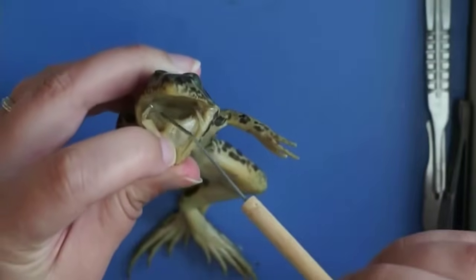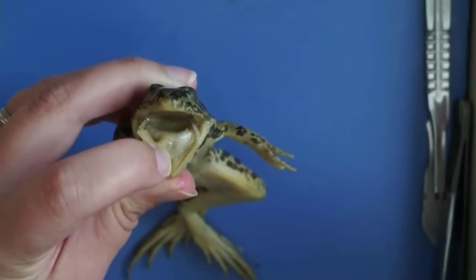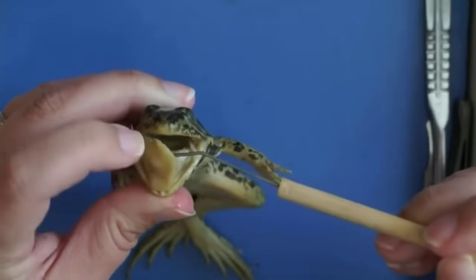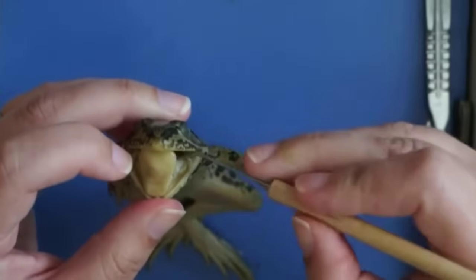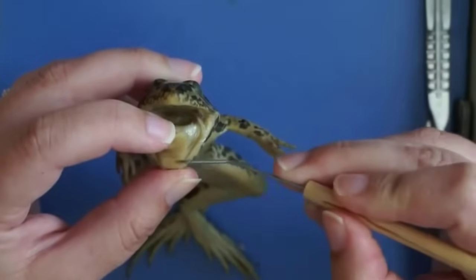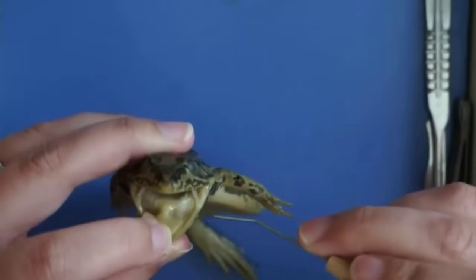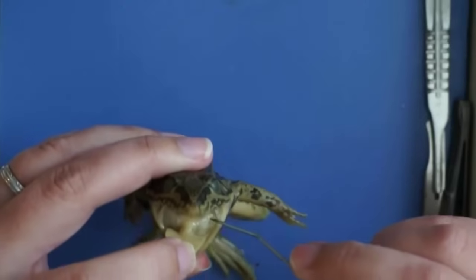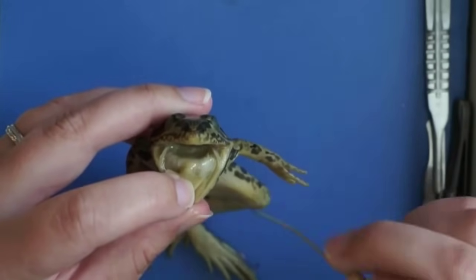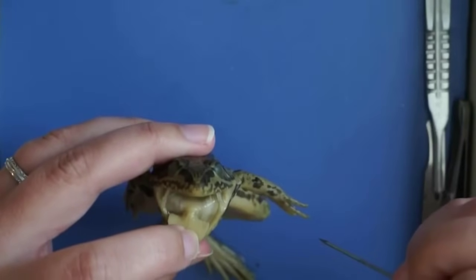You can also see two holes at the back of the mouth — those are openings to the eustachian tubes. The tongue can extend out very far, and it attaches in the front of the mouth in order to flip out much more quickly than we can do with our tongue. In the back, there are two openings to vocal sacs, which help the frog make noise, and then a glottis in the center.